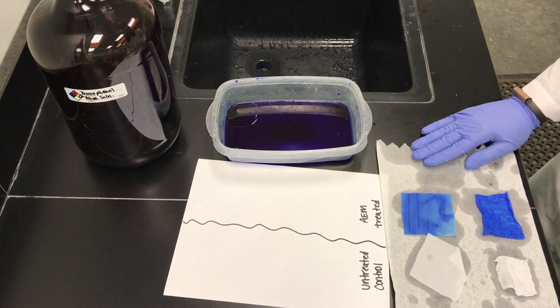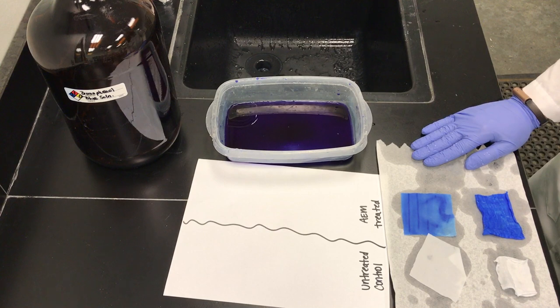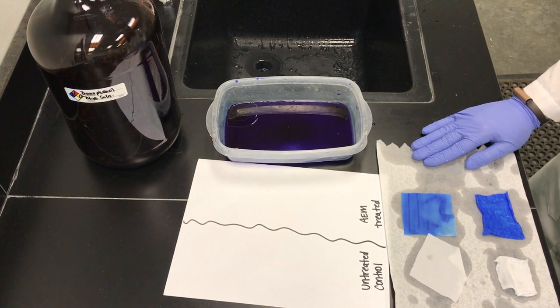Please note that the BPB reacts to any cationic surface, not just AEM. Such cationic materials like softeners, optical brighteners, or dyes can yield false positives.